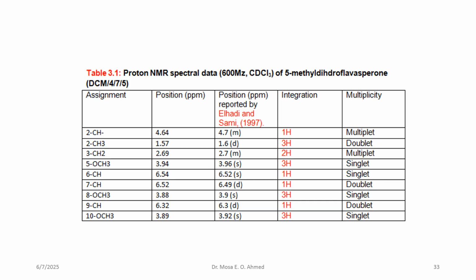Here is an assignment for comparison of proton NMR for 5-methyl dihydroflavasperone using CDCl3 as solvent.